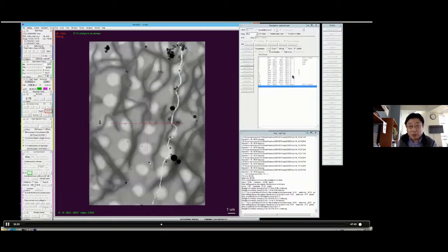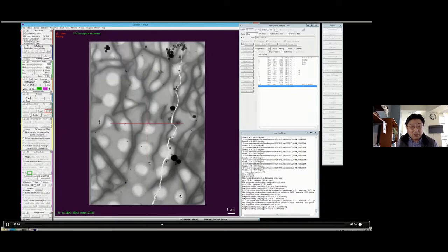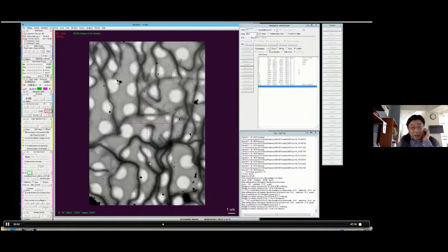And while I continue, because as one of the early questions, if I remember correctly, if you want to collect this data overnight, you want to make sure you have enough targets of interest. And this does take time to select an area, because not every hole has a bacteria of interest, so you have to find them in the area typically. And in our case, we have a good setting, a good sample.